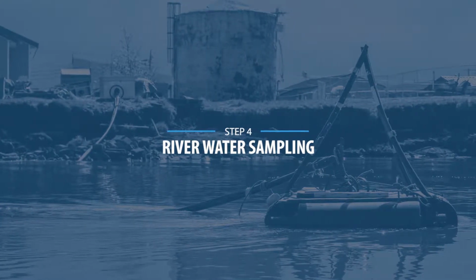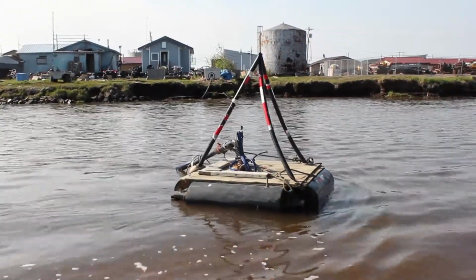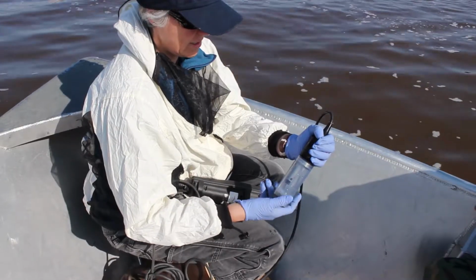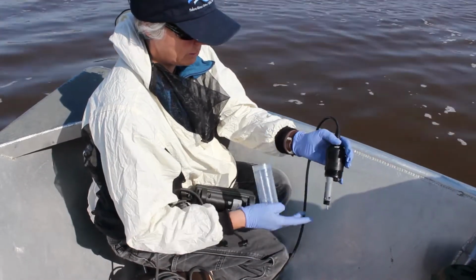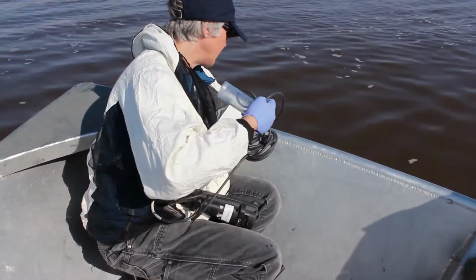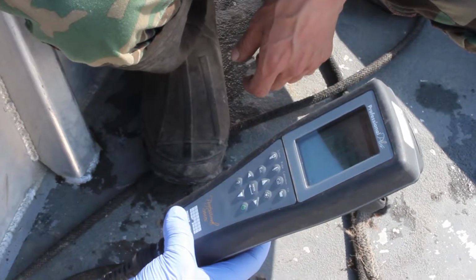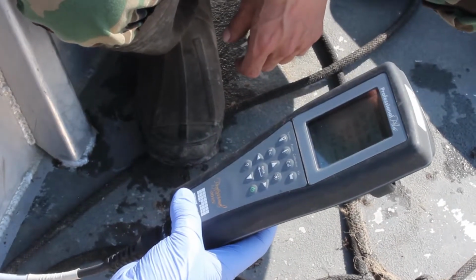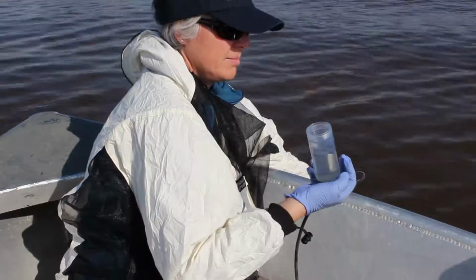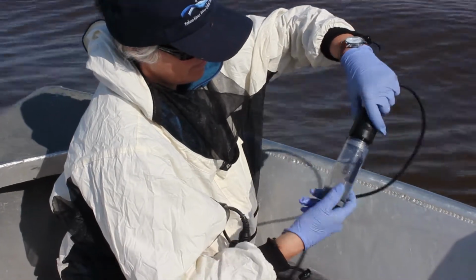Step 4. River water sampling. For Kotlik's project, we sampled next to their drinking water intake pump. Start off by removing the probe from the case and insert it into the water. It doesn't matter how deep you go as long as you are consistent with each sampling. A couple of feet is a good depth. Once the reading stabilizes, write it down in your notes. To protect the probe, fill the probe cup with water before returning it to its case.